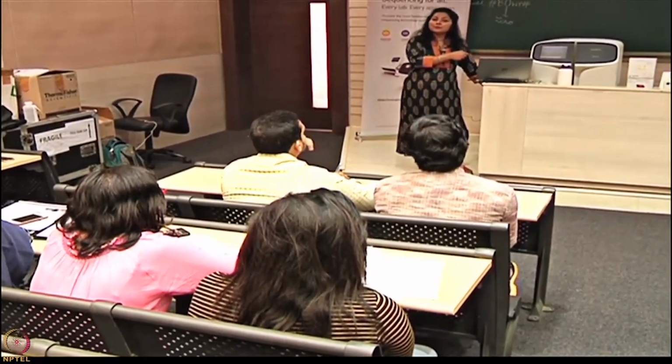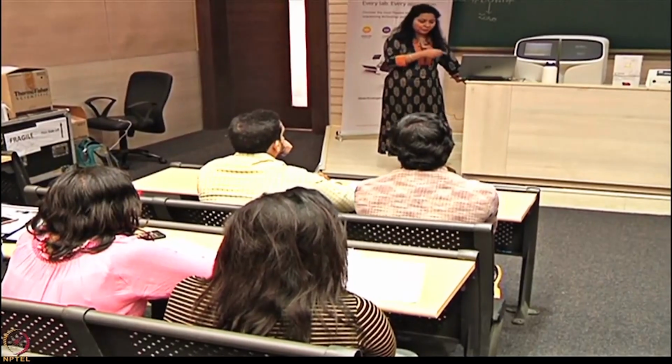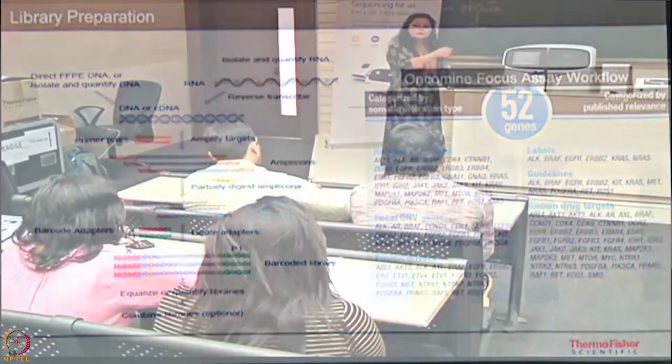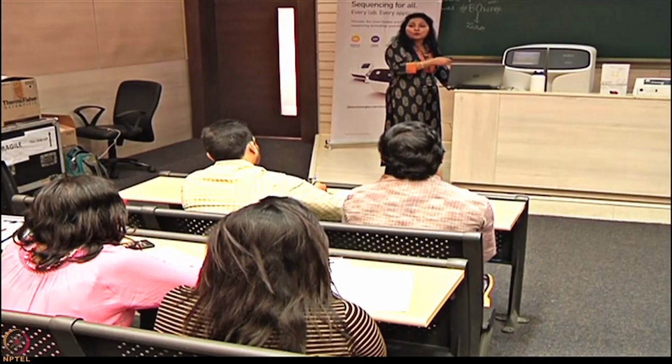This oligo is complementary to one of the adapters which you used during library preparation. If we go back a few slides, we used two adapters, P1 and a barcoded adapter. And we mentioned earlier that we are exploiting these adapter sequences to enable us to sequence these millions of fragments later on one chip.